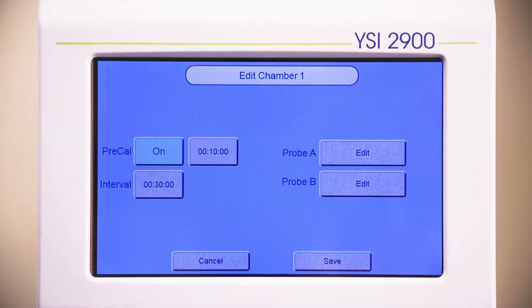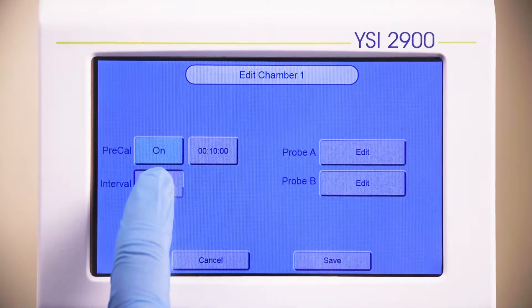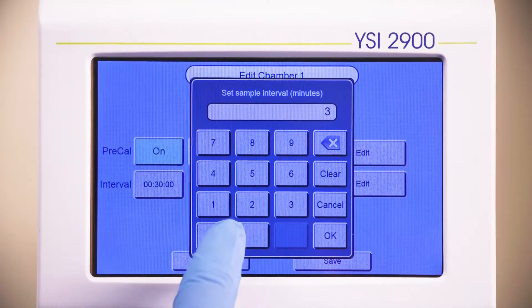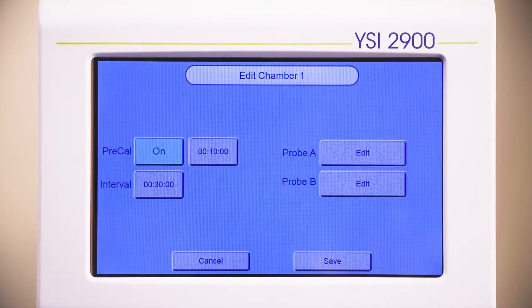An alternative to Pre-Cal is the instrument's Auto-Cal settings found in the Settings menu, under the Calibration tab. Next, set the interval for your monitoring measurements. The default interval is 30 minutes.